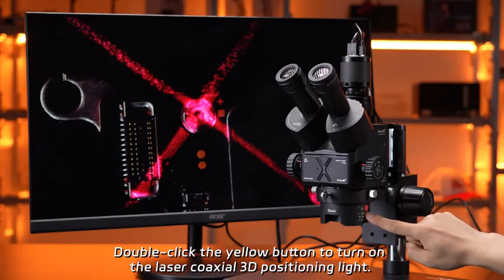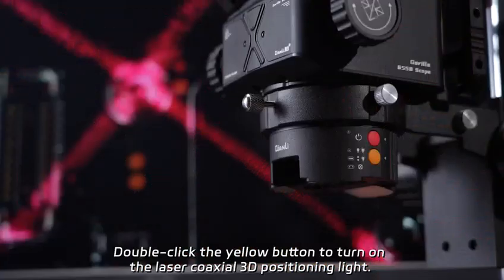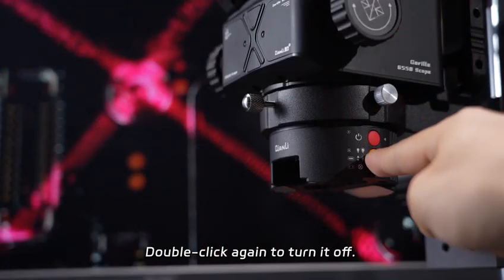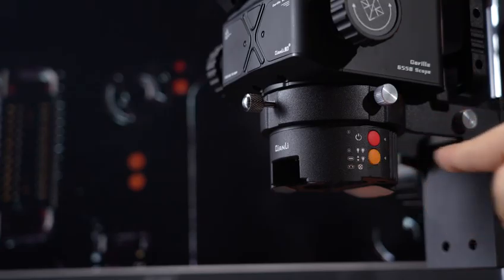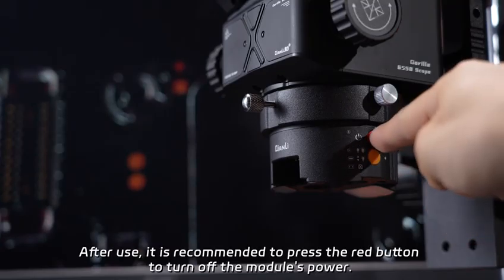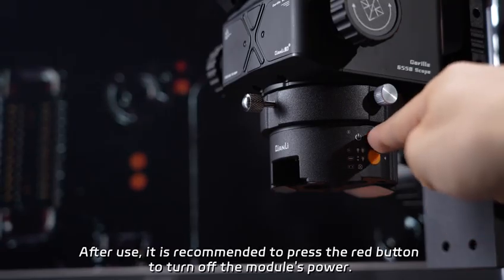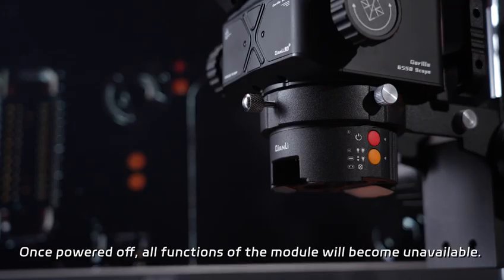Double-click the yellow button to turn on the laser coaxial 3D positioning light. Double-click again to turn it off. After use, it is recommended to press the red button to turn off the module's power. Once powered off, all functions of the module will become unavailable.